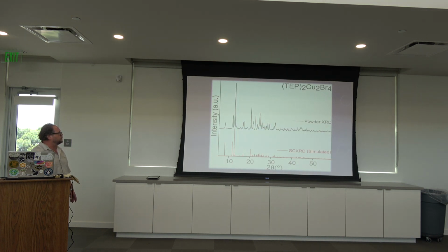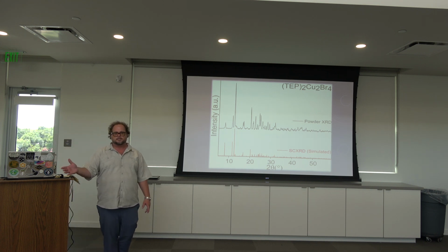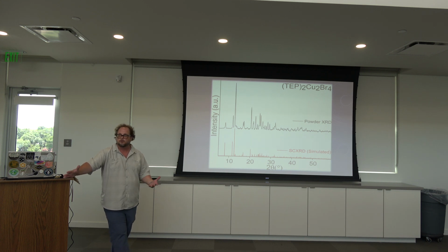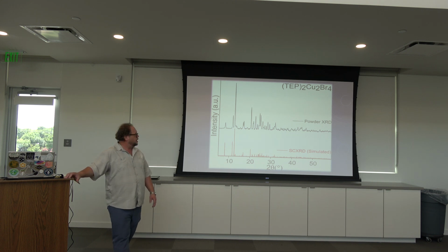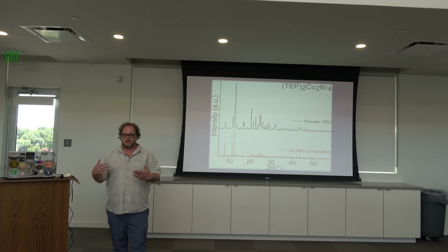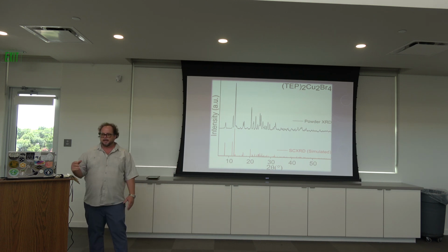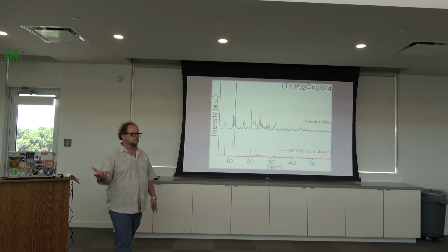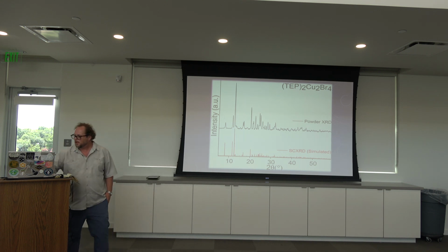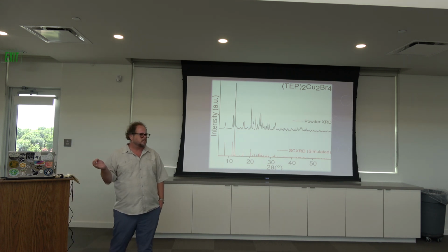All right, so one of the things that these materials need to be able to do is be really stable. One of the ways we can look at their stability is by doing a test called a PXRD, which is a powdered X-ray diffraction. So we have a crystal here. We wonder what's going to happen if we turn this crystal into a pulverized powder with a mortar and pestle, and are we still going to have the same compound if we pulverize it? This will tell us something about its stability.